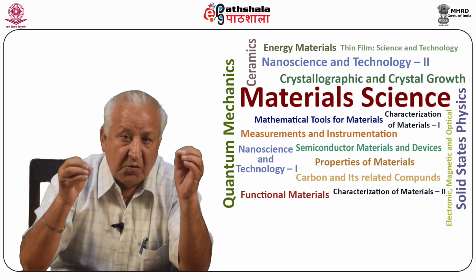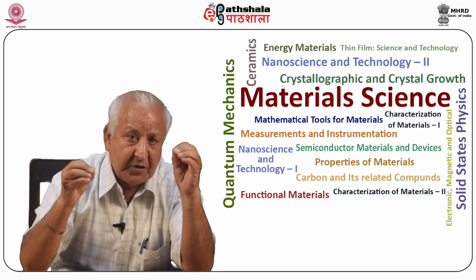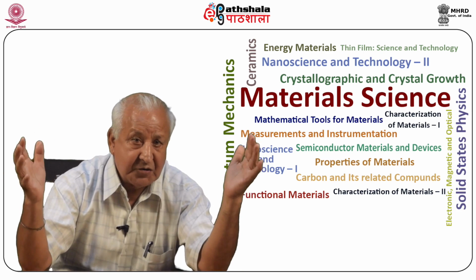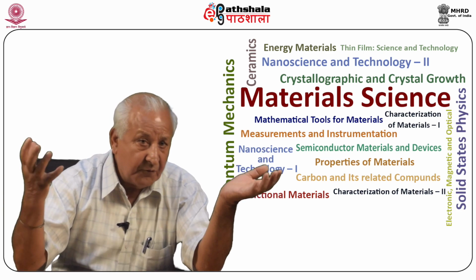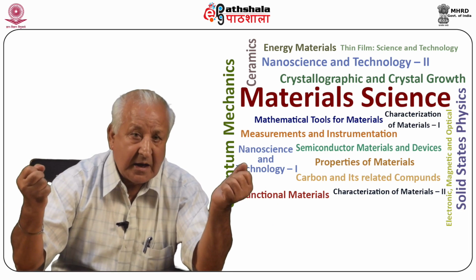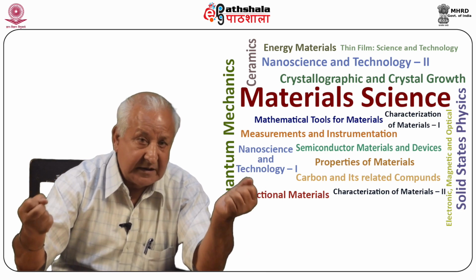The apparatus is shown in figure 27.5. The main components of this setup are two small U-tubes containing gel columns, which are joined with one end to a burette and with the other to a thermostated double-walled glass vessel containing a stirred growth solution with rotating seed crystals.